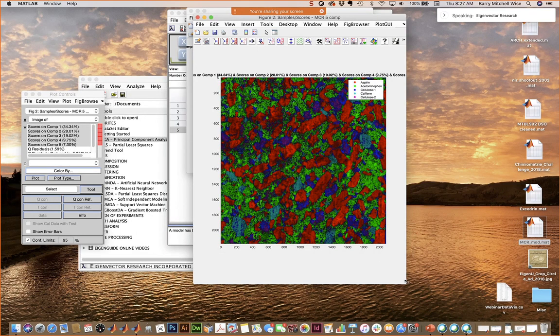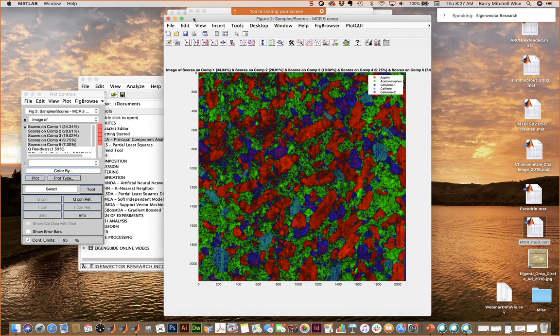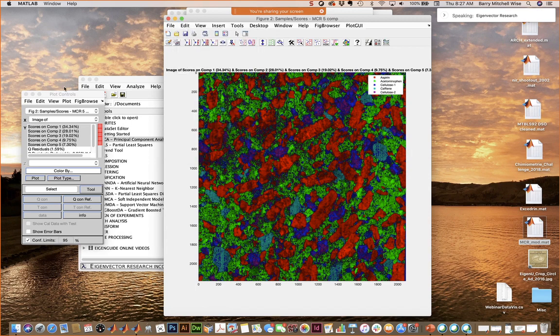So yeah, you can. To really get that to show up in the plots, you have to turn it into a classical least squares model and do that. We were fussing with that a little bit yesterday, trying to find an easier workaround for it. Let me just say that it is possible, but the workaround is a little bit of a pain.